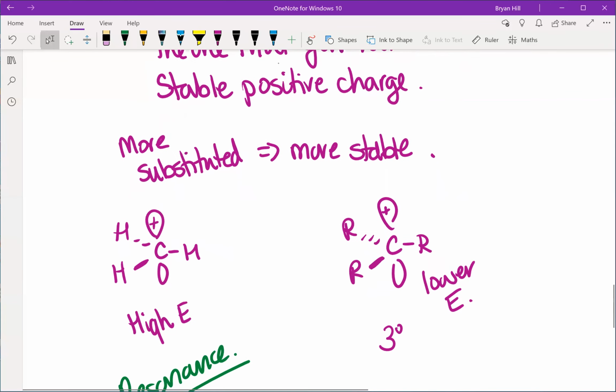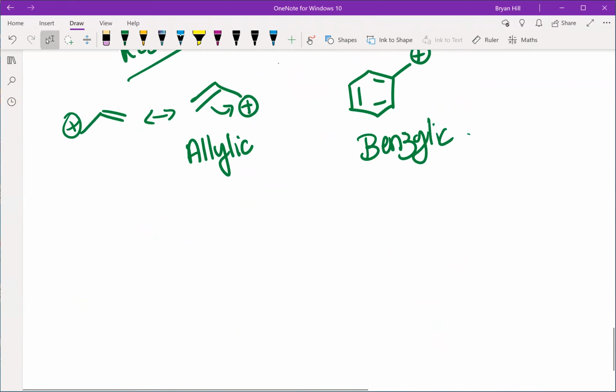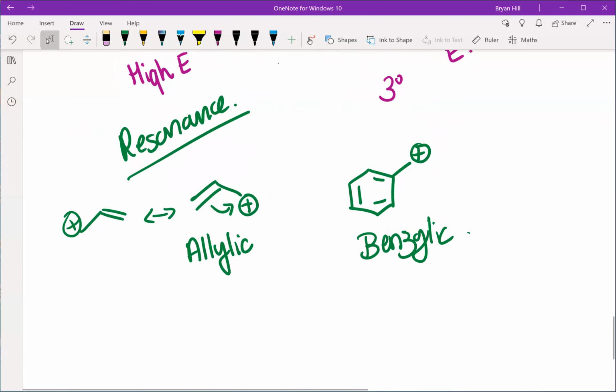Now, the one thing to keep in mind is that these ionization processes, particularly electron impact or electron ionization, are super high in energy. You're providing lots of kinetic energy to the molecule, so it can fragment in other ways. So some of our normal rules are kind of broken because there's so much energy involved when these things break apart. I'll show some of the ways that these things break apart.